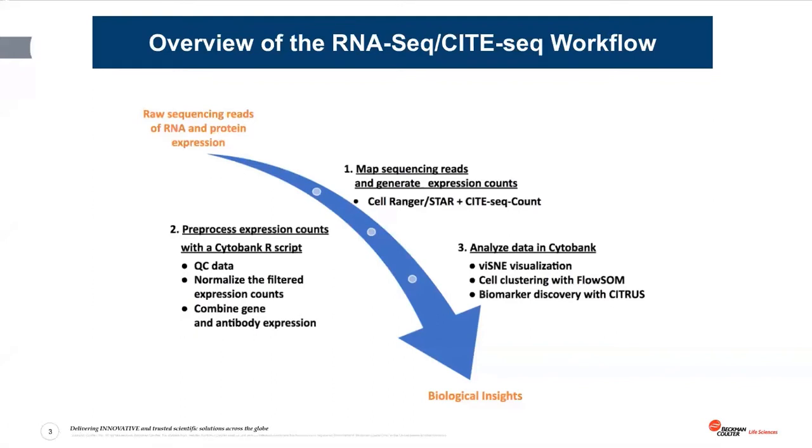If your data is single-cell RNA-seq data, you will only get the RNA-seq expression information. You will not get the protein expression information. Then you can take your raw sequencing reads and go through this 3-step process to get your biology insight.